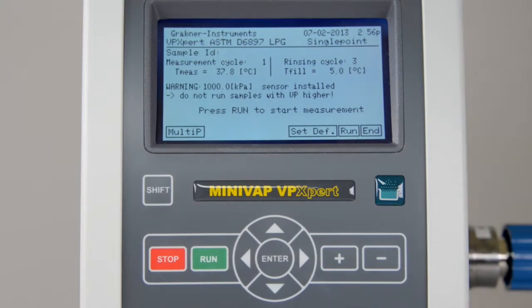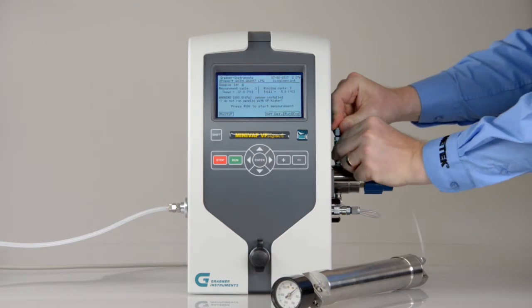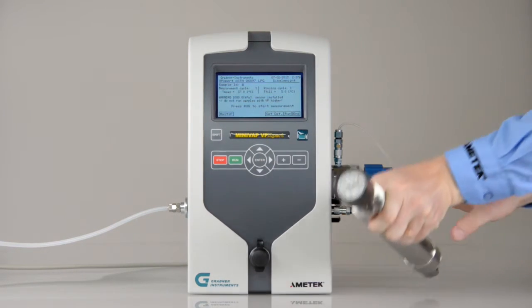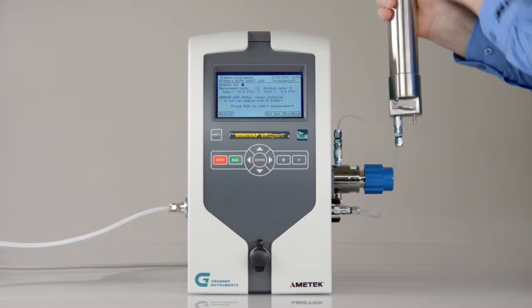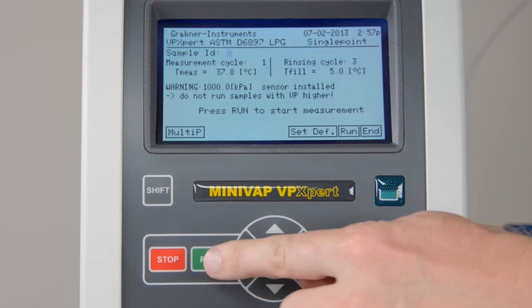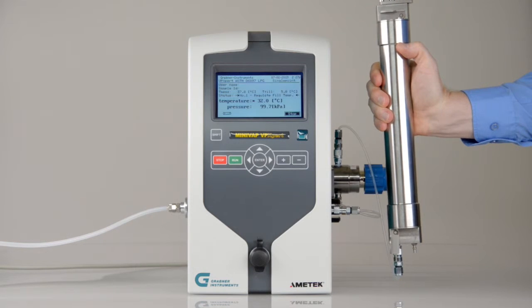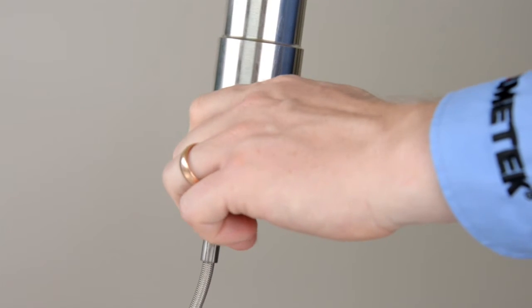Place the cursor on ASTM D6897 and press Enter. Select the sample ID. Connect the pressure regulator with your LPG container. Turn the LPG container upside down. Open the valve of your container and press Run to start the measurement. After the filling temperature of 5 degrees Celsius has been reached, the instrument valve is opened and the sample flows into the measuring chamber. When rinsing and filling is done, close the valve on your LPG container.